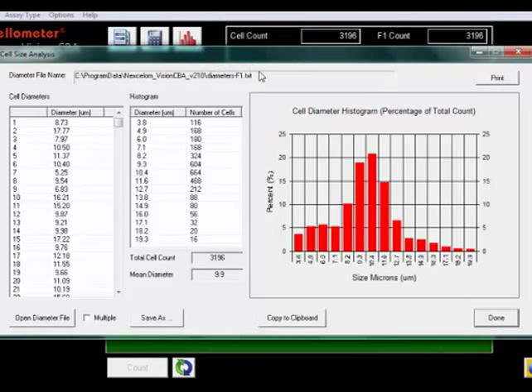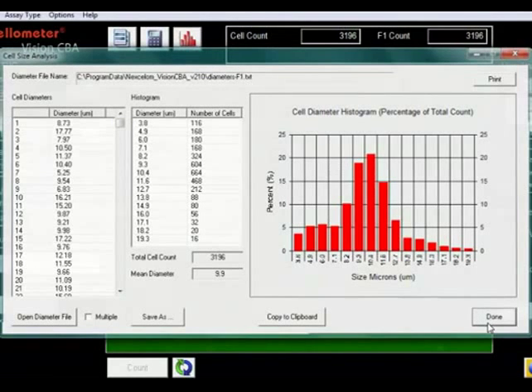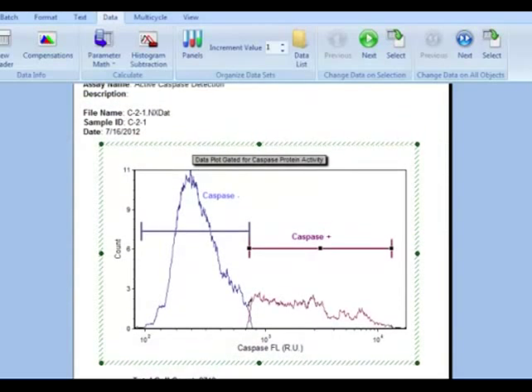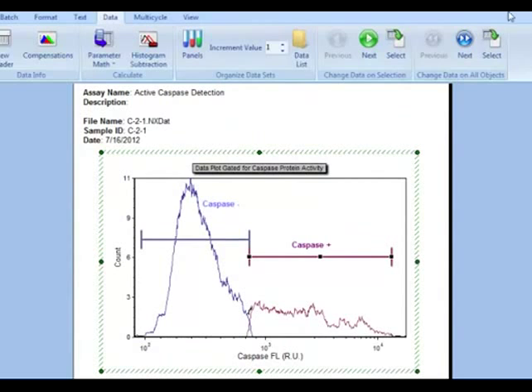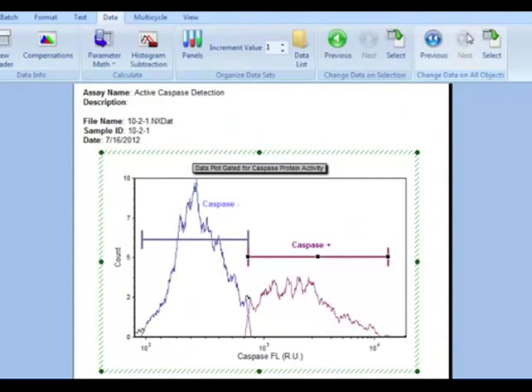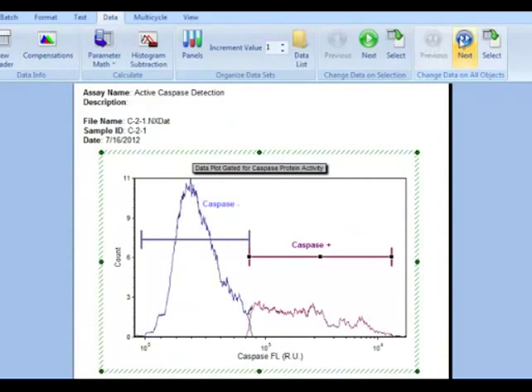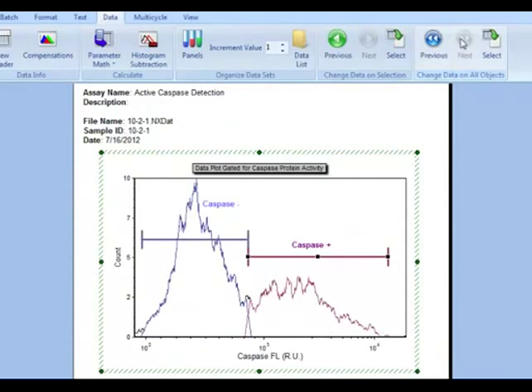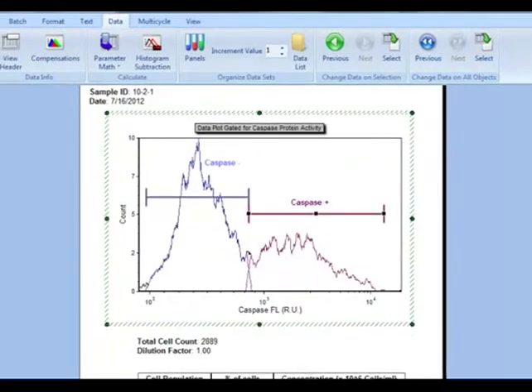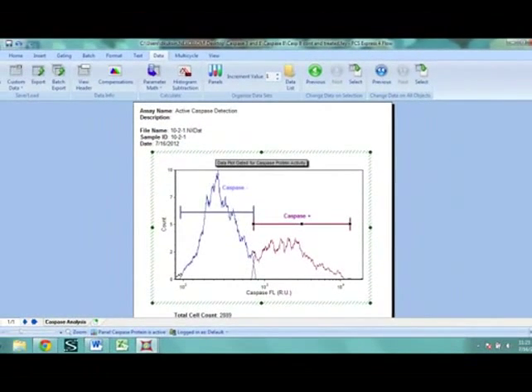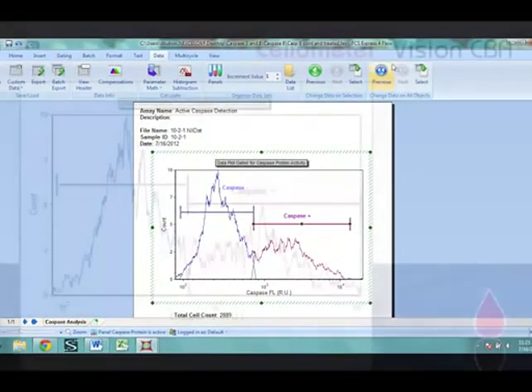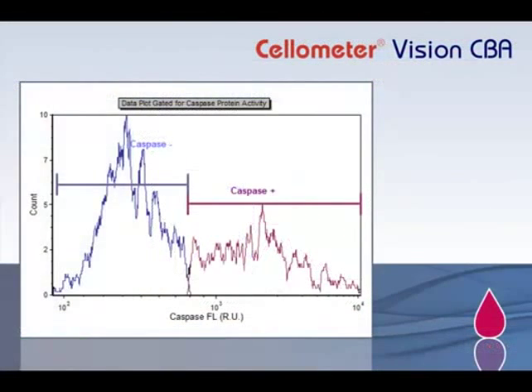The diameter of each cell is measured to generate a size distribution histogram. Control gates can be applied to treated samples to measure increases in the active caspase-8 population.